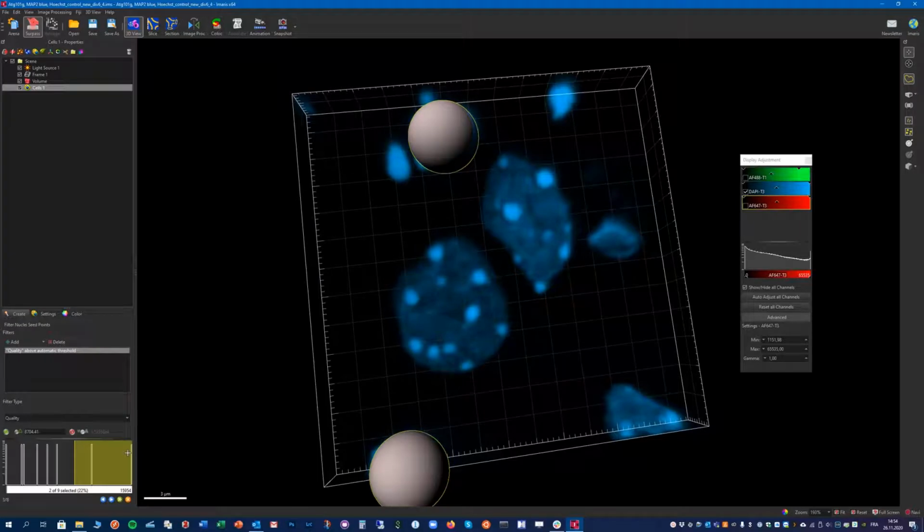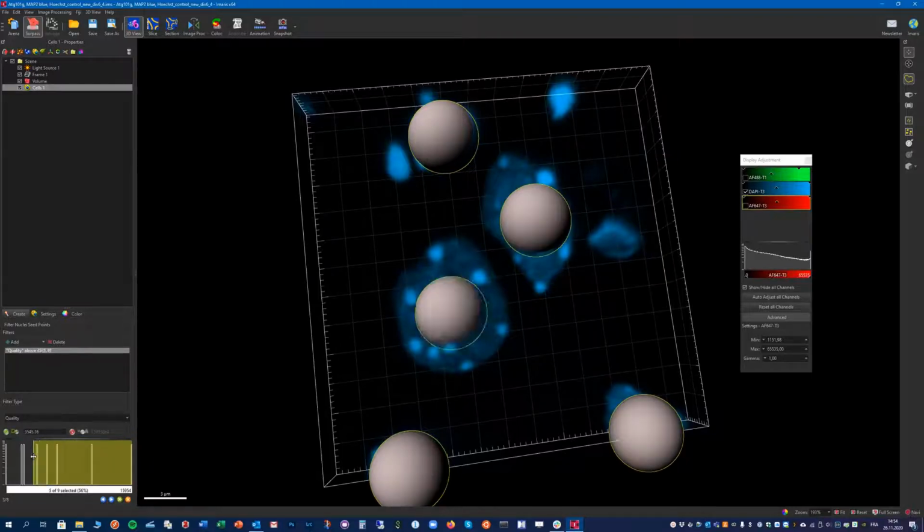by going to the next step here, we can decide to filter those points by including cells which have a quality threshold large enough to be included, and maybe we can add another filter to exclude nuclei or objects that look like nuclei which are at the periphery of the image.